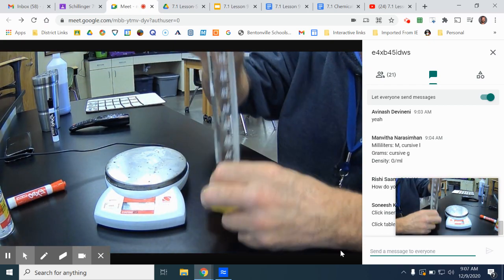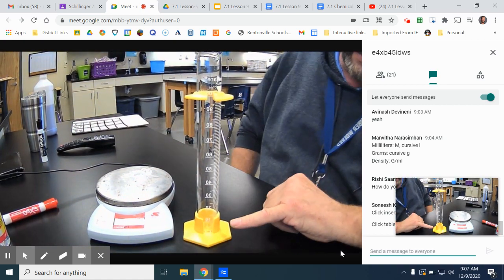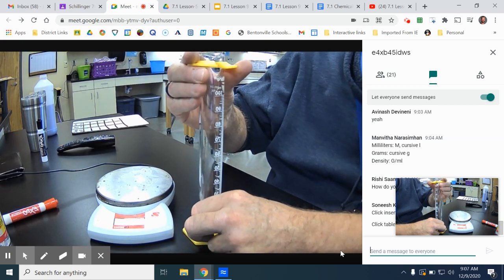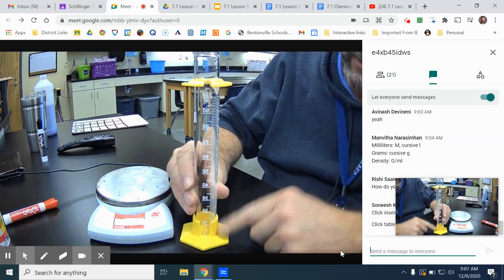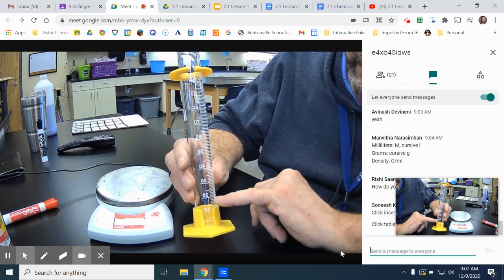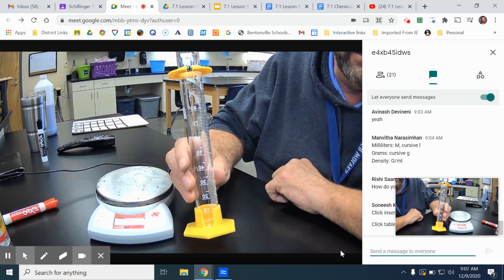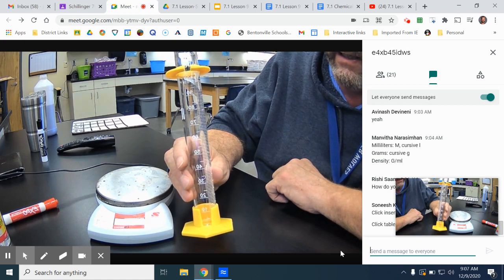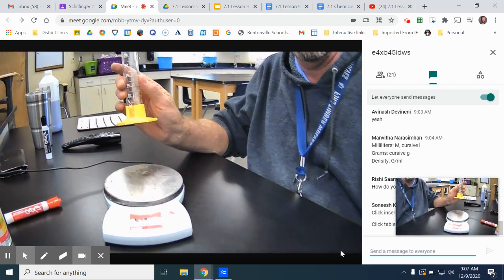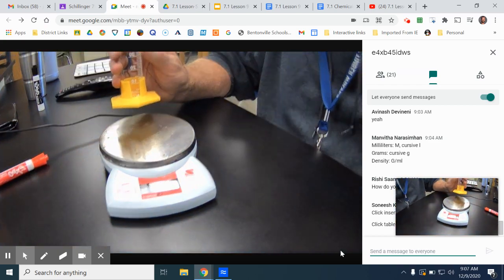What I have here is called a graduated cylinder. These are milliliter marks. This is a 100 milliliter graduated cylinder. We have units of 10 going up, with each line individually put in there at 1 milliliter. So to do this, try to get a good angle on it. I might actually have to go freehand with my camera.